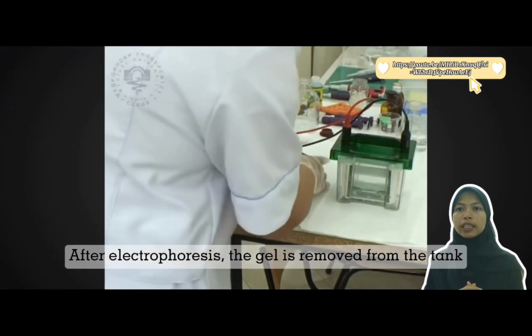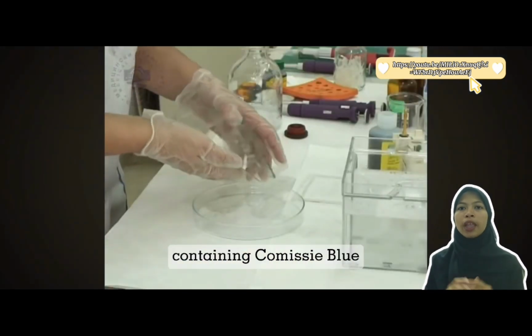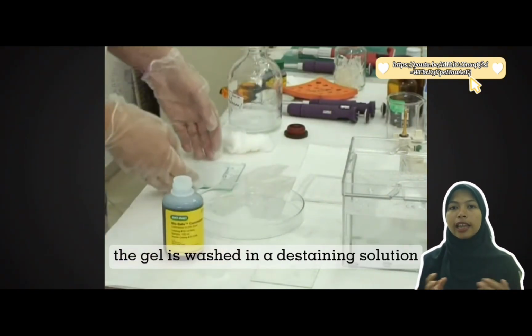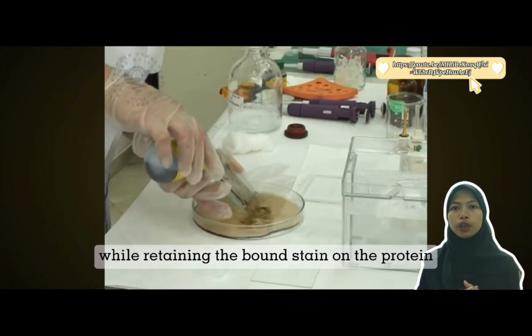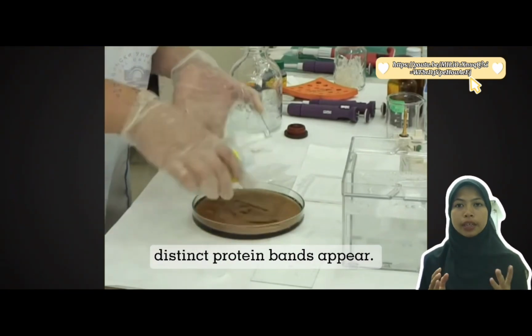After electrophoresis, the gel is removed from the tank and placed in a staining solution containing Coomassie blue. This dye binds to protein but not the gel, making protein bands visible. After staining, the gel is washed in a destaining solution containing methanol and acetic acid. This step removes excess stain from the gel while retaining the bound stain on the proteins. Once the gel is fully destained, distinct protein bands appear.